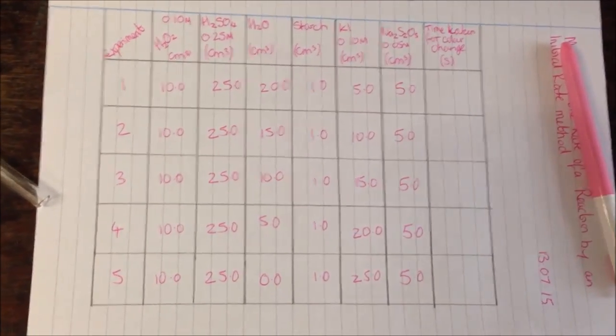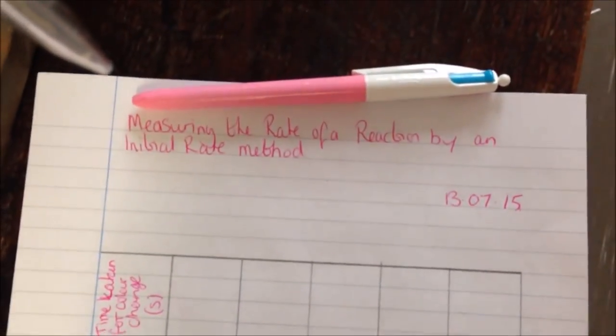So now we're going to be looking at measuring the rate of reaction by an initial rate method, and this is for an iodine clock.